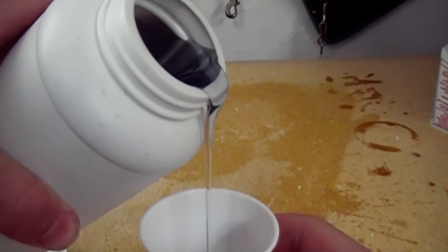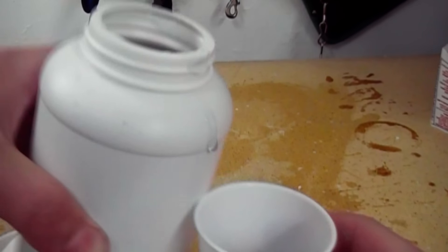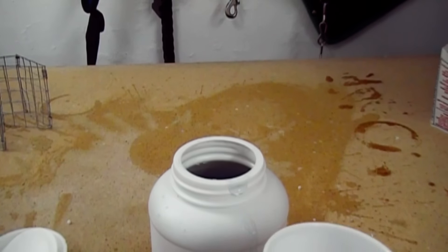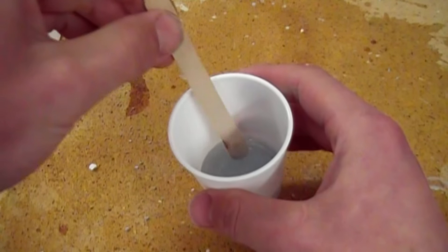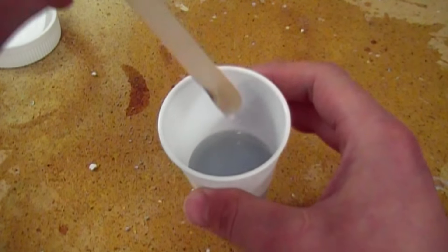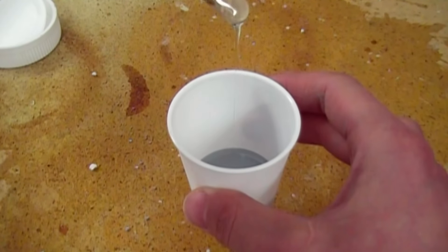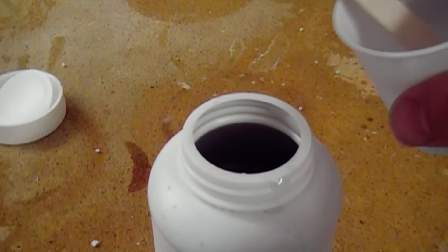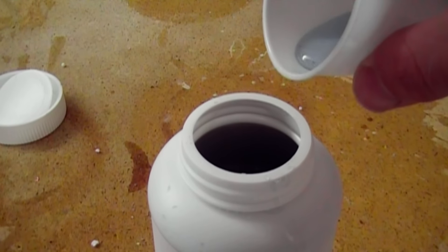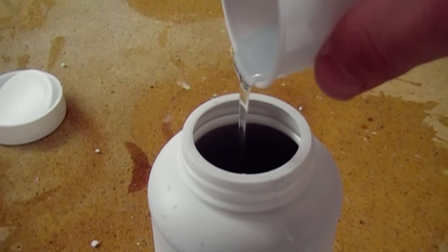In this video, I'm going to be making sodium silicate, also known as water glass. Sodium silicate is fairly useful, although not widely used these days. I'm going to be using it as a high temperature adhesive. The difficulty in locating pure sodium silicate is the reason why I'm going to be making it today.